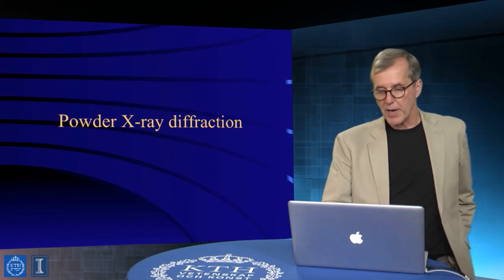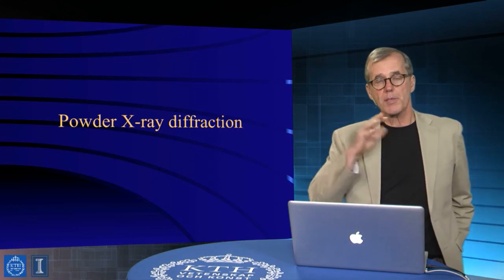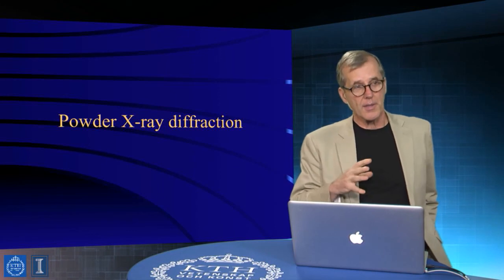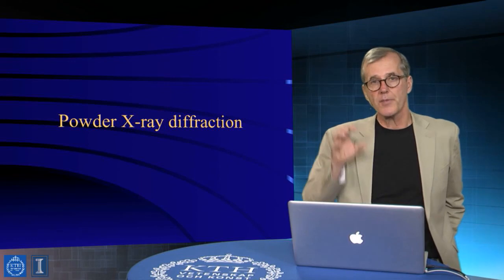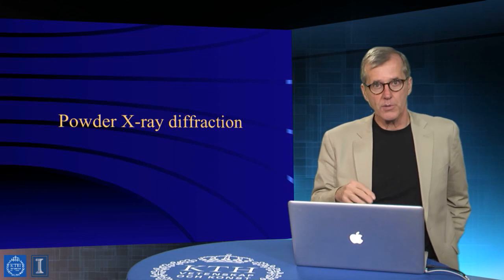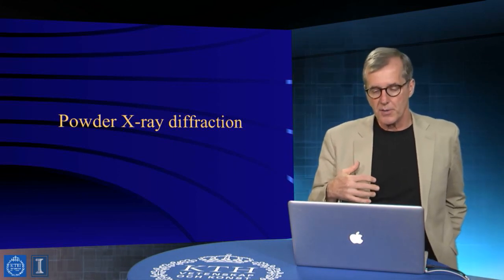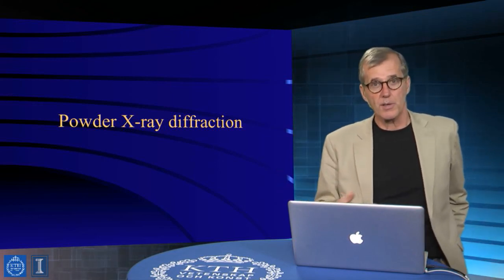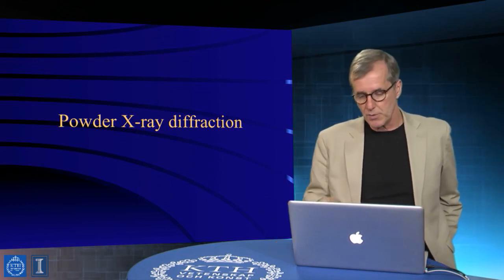Okay, so powder X-ray diffraction. This is how you will normally do it. Some of you may actually be inorganic chemists, and a lot of my friends in that world do a lot of single crystal X-ray structure work as their penultimate analytical tool. It's not something that I tend to do, because very few of the things that I do, with the exception of work with semiconductors, involve single crystalline materials. Semiconductors, that's not the case, because we're doing electronics.